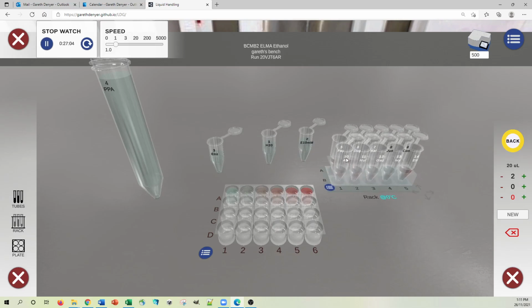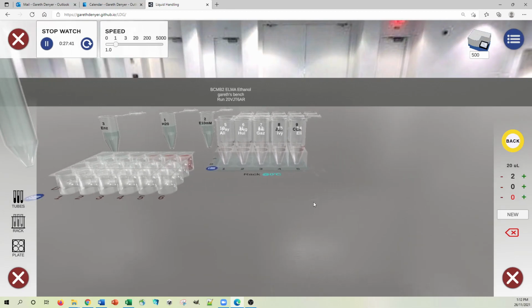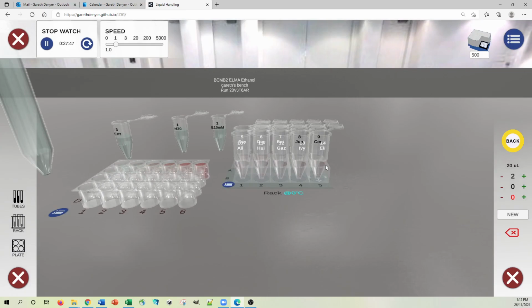Now you can see that each one has a number and a name. The concentration of ethanol in each standard is unique for each student. So every single student gets a completely different problem. So you can't possibly get any copying of other people's results. You can get copying of the strategy people follow, but not the actual data. The other thing that you might notice here is that the samples are slightly pink already. And that was something that really confused a lot of the students. And the reason why they're pink already is that the blood samples have undergone some hemolysis as they've been made into serum.